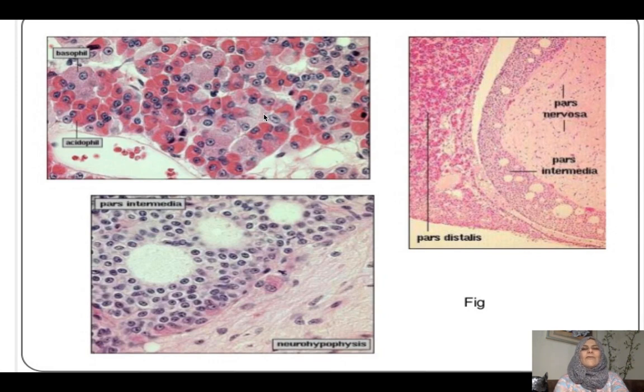The chromophils هي الخلايا اللي تاخذ الصبغة، أوكي، فلذلك تبين عندنا طوخ بالسلايد. الكروموفوبس اللي هي تكون less stained، تكون فاهية، لونها فاهي بالسلايد يكون موجود. يعني هسه أني من السلايد أقدر أقول إنه هذه هي الكروموفيلز. طبعا والكروموفيلز are either acidophil or basophil، وهذين اللي ألوانهن فاهية راح نقول عليها the chromophobes. And the chromophobes are thought to be degranulated cells of the chromophils أو non-functional stem cells. هيك يقسم الكروموفوبس. تمام؟ زين، نرجع الfolliculostellate cells are of non-function.